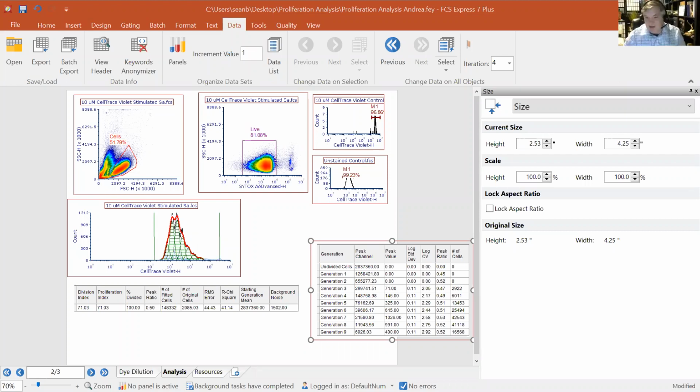Yep, and somehow I knew that question would arise. It's going to be valid for this and for cell cycle analysis. Essentially, I don't know what the minimum limit would be, right? Some people say they can get away with a few hundred. Some people say they need 10,000. Some people say they need 50,000. Maybe you need a million. I'm not quite sure. Really, what you need is whatever minimum it takes to model this data correctly. So I would err on the side of caution and collect more events if possible.